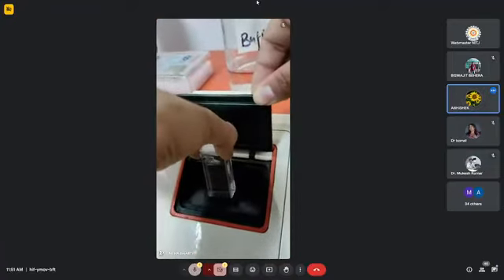After closing the lid, we tap on the enter option, and it shows us the measurement. So this gives us the fluorescence which has been calculated by the instrument, with the average, standard deviation, the coefficient of variance and temperature also.